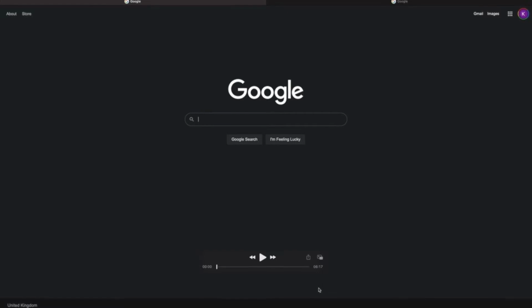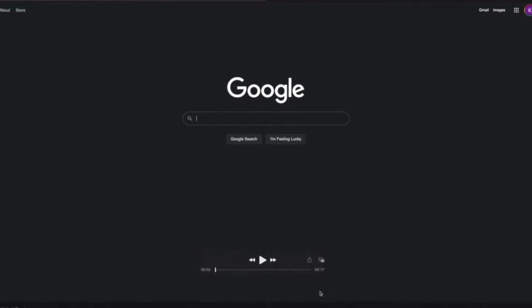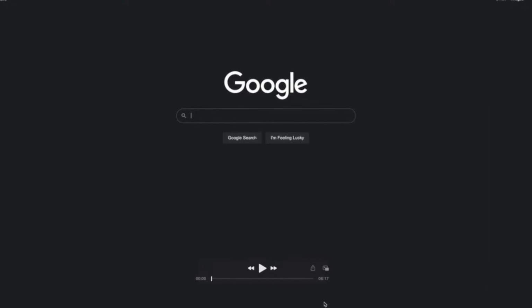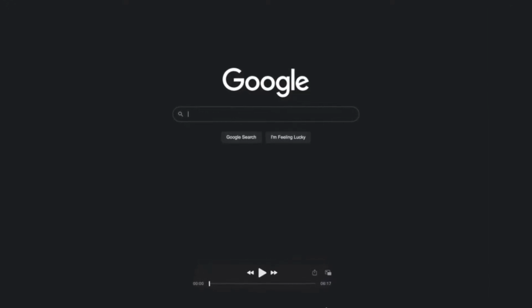Hi there, today I'm going to be teaching you how to design a primer for RT-PCR, a skill I learnt whilst partaking in a summer research scheme with the University of Warwick.